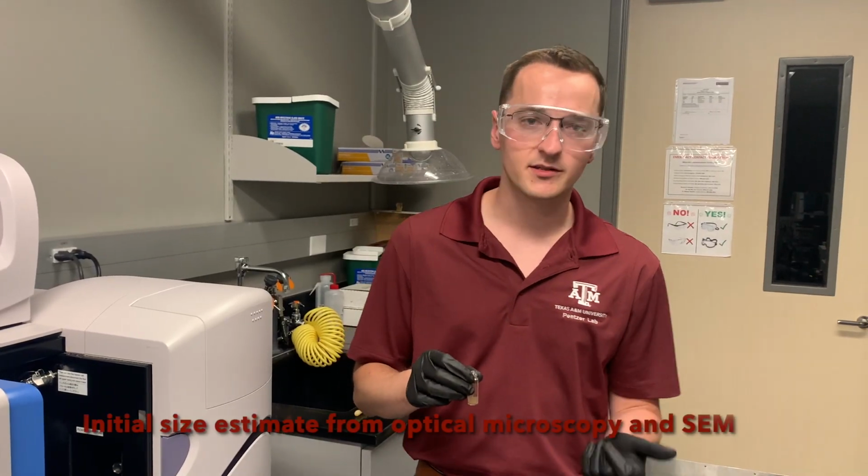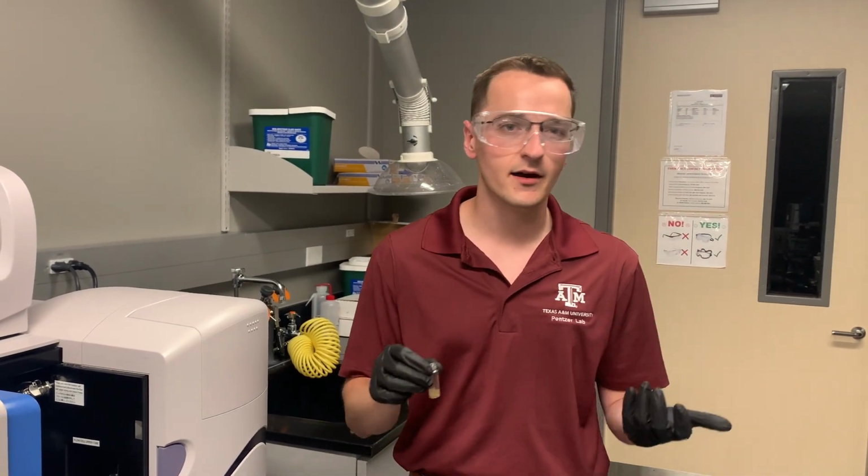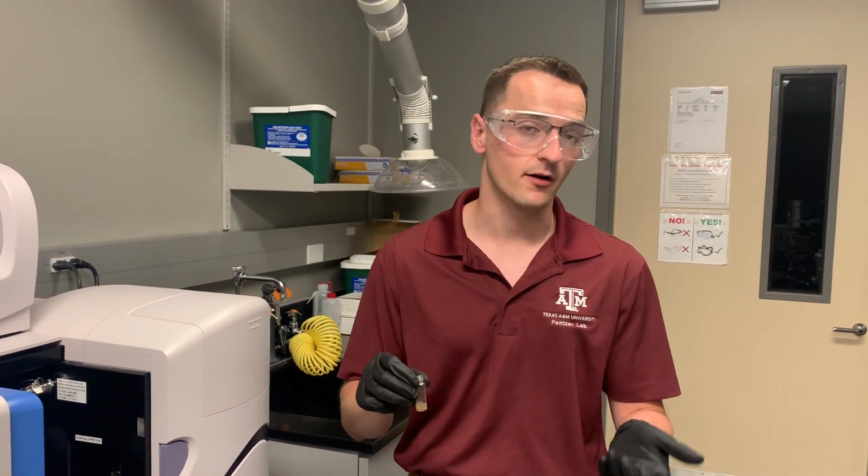Based on optical microscopy and SEM, we know that these microcapsules should be on the micron scale, somewhere between 10 and 80 microns in size.